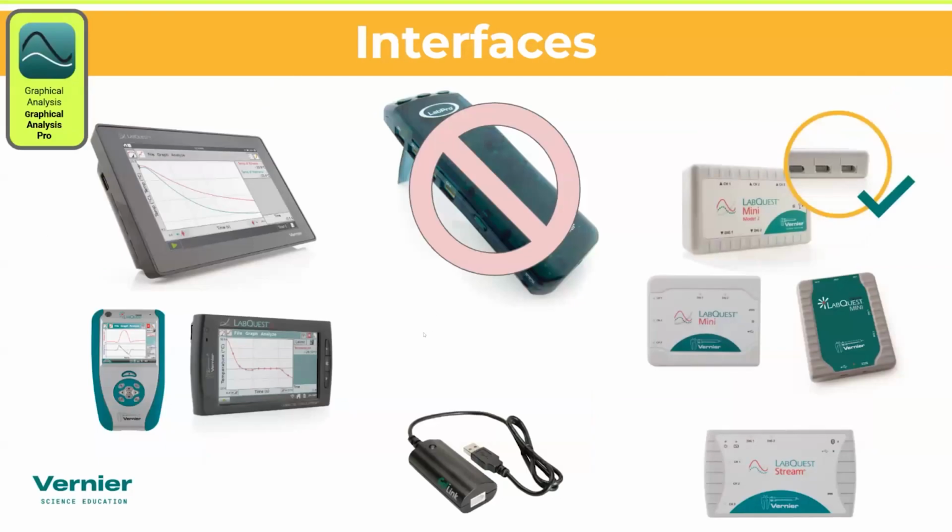So interfaces, remember our beloved LabPro. Well, of all the interfaces that are pictured on this slide, LabPro is the only one for which we don't have support in these analysis apps. In fact, interfaces you only need for Graphical Analysis. The other applications don't use sensors that require interfaces. So this really only pertains to Graphical Analysis or Graphical Analysis Pro. So any of these will work.